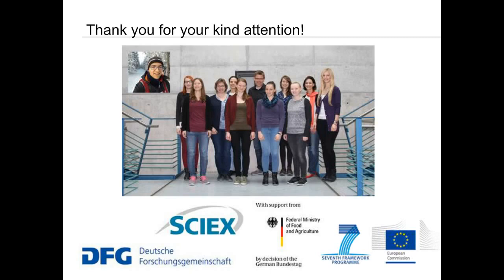When it comes to allergen detection, I think that mass spectrometry is the ideal solution as we directly detect the eliciting agent, the food allergen, by detecting really a specific structure. And this is the problem with PCR. You detect the DNA and not the eliciting agent. Again, by processing, there can be problems that DNA and proteins are degraded not identically, and therefore I think that here the direct detection of the allergen is the best solution. Is there any opportunity to speed up the sample prep time?